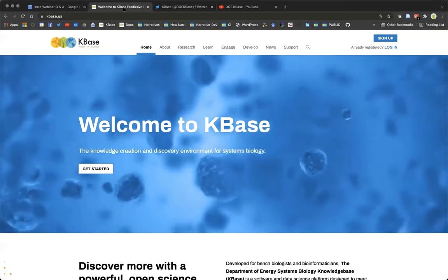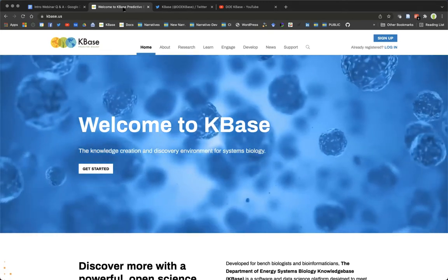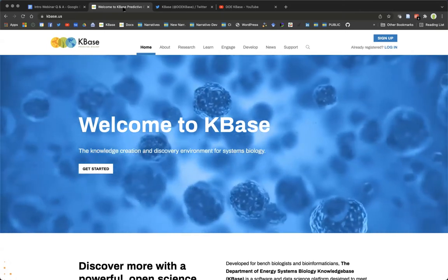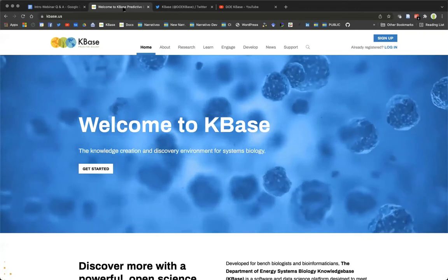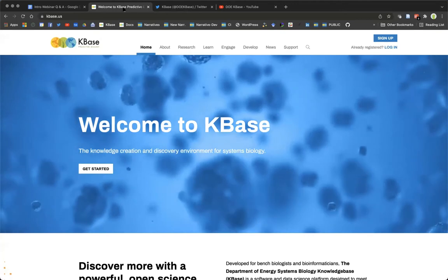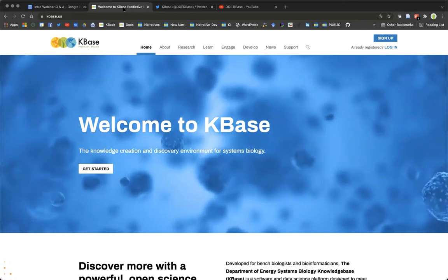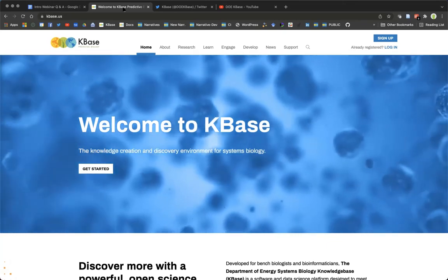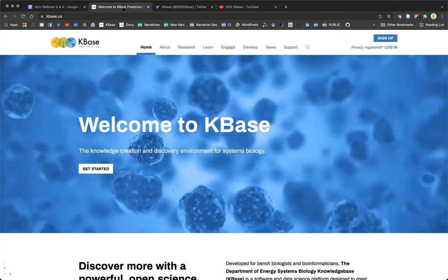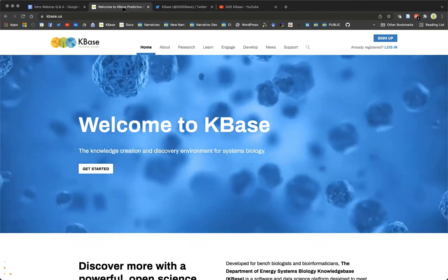My name is Benjamin Allen. I am the outreach coordinator for the KBase project based out of Oak Ridge National Laboratory. KBase, if you didn't know, is the Department of Energy Systems Biology knowledge base. It's a free and publicly available resource for the scientific community to perform all sorts of multi-omics analysis in a nice, simple, and easy to use graphical user interface. And it's so much more. And we're going to talk a little bit about all of the things that KBase is in a second.